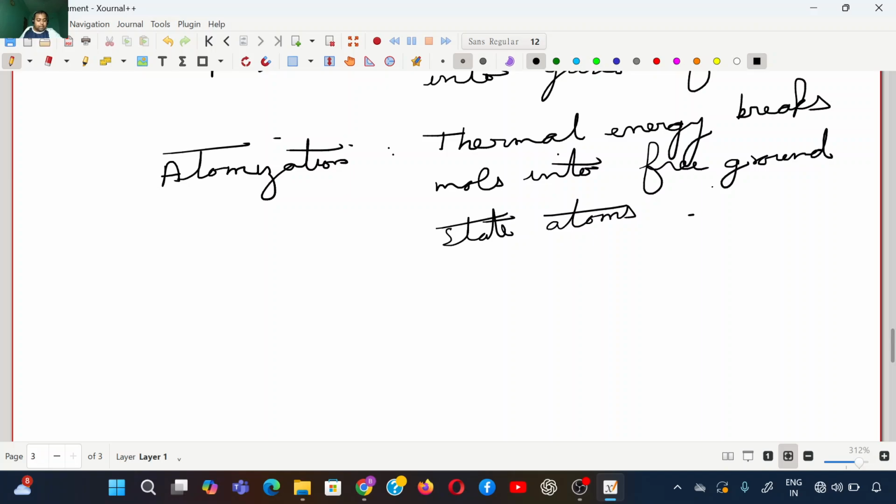In parallel, there can be many reactions in the flame also. If it's a compound, it can dissociate into its elements, like CuCl decomposing into Cu and Cl. New compounds can also be formed, or the element can give rise to an ion, releasing an electron also. So these kinds of side reactions also happen in the flame.